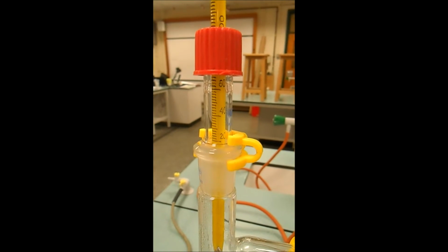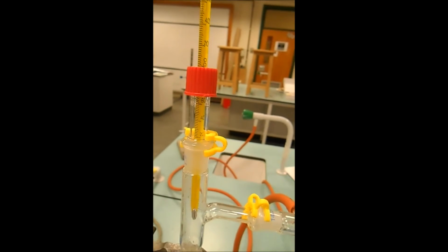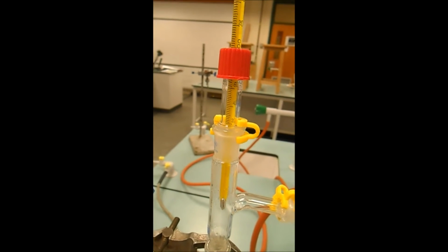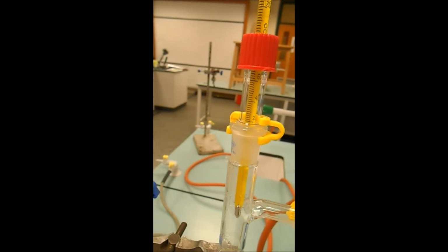So this is reading about 60-ish degrees. I don't know if you can see it on there, but that's okay, because our next most volatile thing in there, apart from our product, is actually the alcohol itself, and that's 97. So as long as it's below 97, then I should be fine.